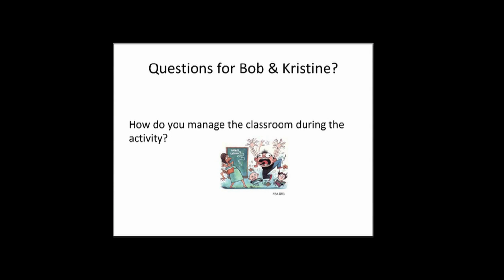Sure, and I guess I'll go ahead and take that, and Bob, feel free to chime in also. So a couple of ways, or several ways. One that we didn't mention is I usually like to have a video feed. So we have a webcam on our end, and if you also have a webcam in your classroom, that's great, because we can see each other, and there's really that personal connection, and it's a way to feel like we're both in each other's labs or in each other's classrooms. So that really helps with managing that way.